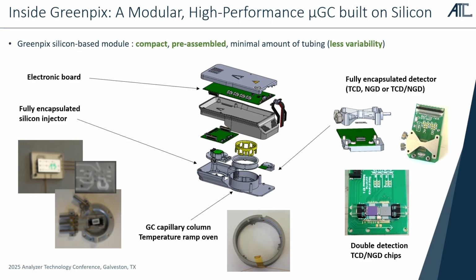Usually they buy multiple copies of the same module, and if something bad happens, they can just swap in a new module and maybe repair the old one in more favorable conditions, like in a factory. On site, with all the dust, it's a difficult operation to change a column. Something that's very easy to change is the electronics that you see on the top here. If there's any problem with the electronics, it's very easy. But the column is a different topic.